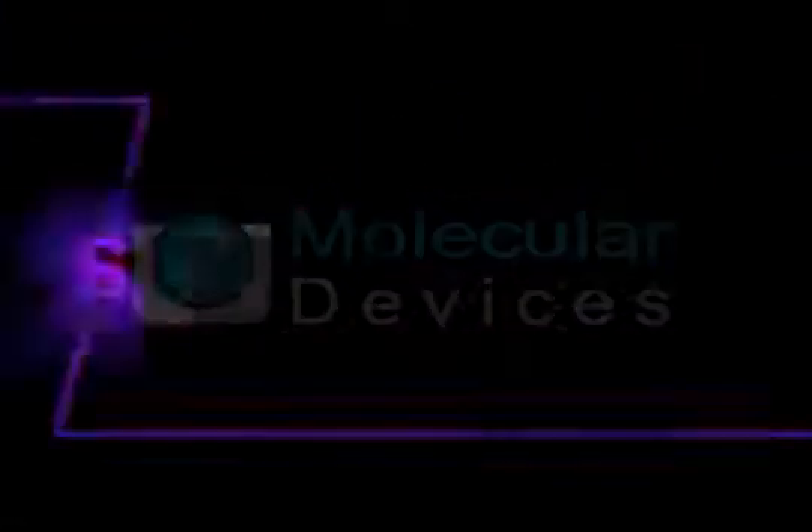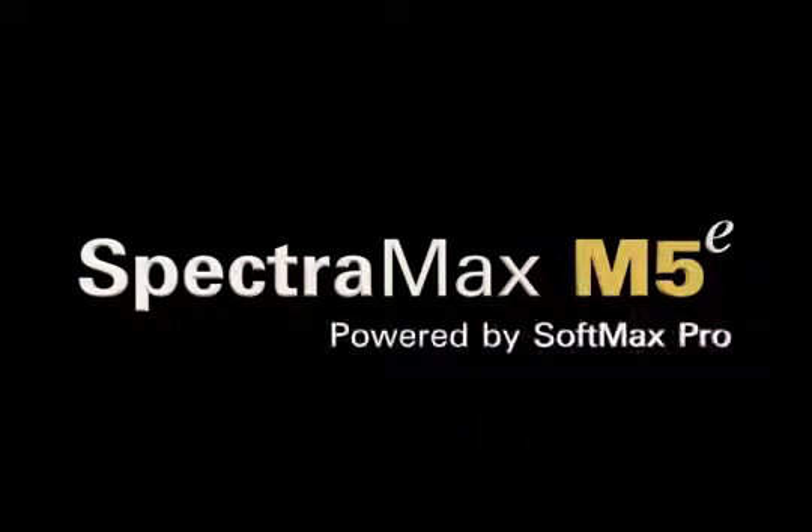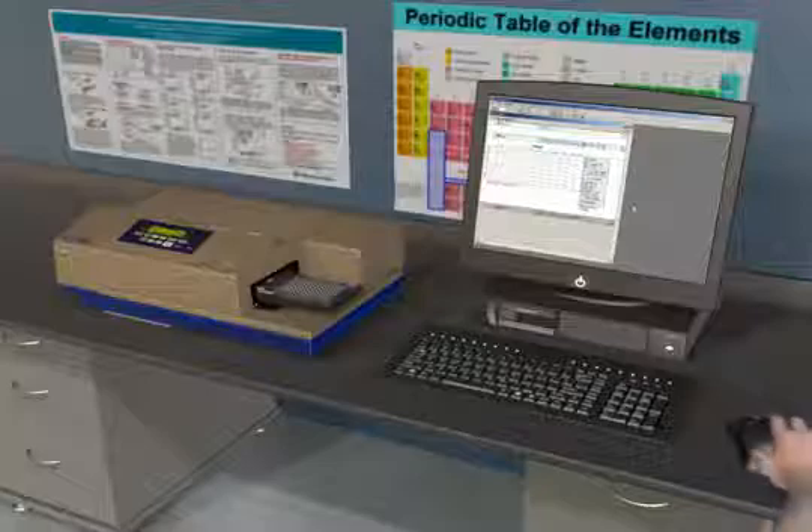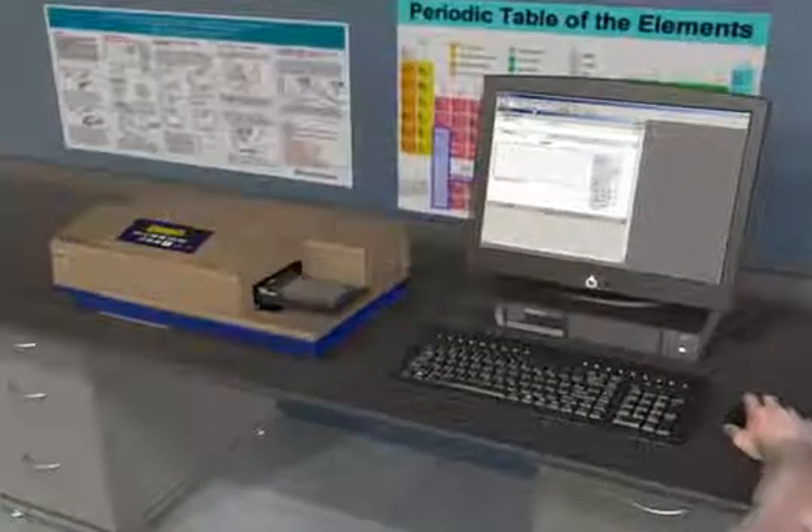Molecular Devices. The SpectraMax M5e Multi-Mode Plate Reader comes ready to use in your lab with our integrated Softmax Pro software for data collection, analysis, and graphing.